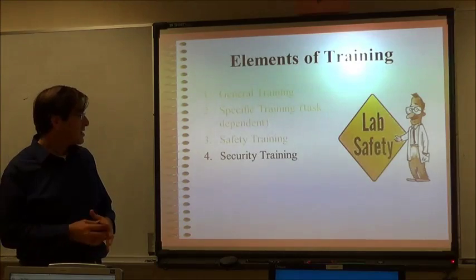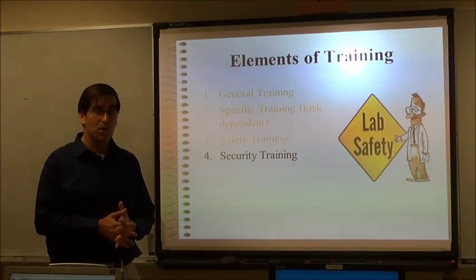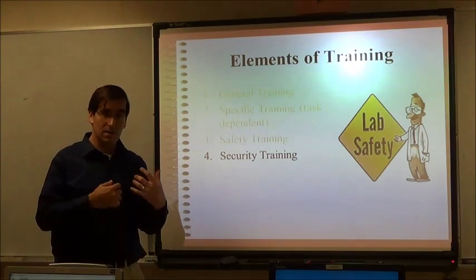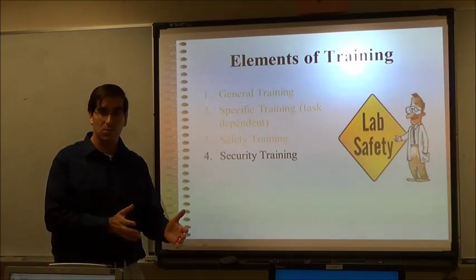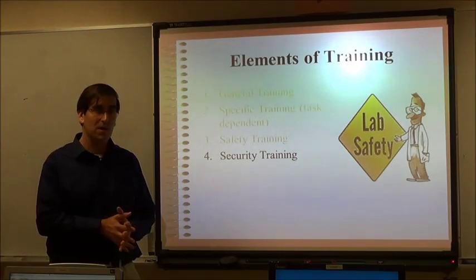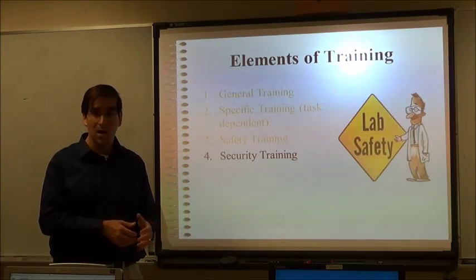Then there's always an aspect of security training that people always fail to think about. When you're working in a laboratory, security is important for many reasons. One, you don't want random people to be able to just walk in and hurt themselves, but there's also always the risk of somebody coming in on purpose, say, to steal something.